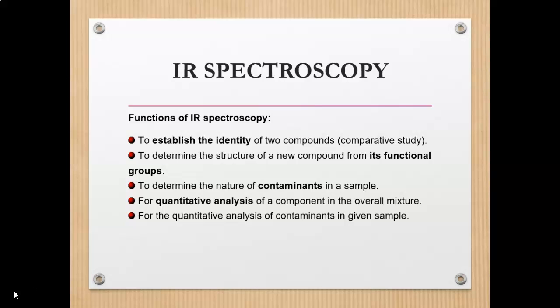Okay, for the second function, we want to determine the structure of a new compound from its functional group. So as I mentioned, if you have done the modification of that polyester resin, you can determine the new peak present in the new modified polymer.